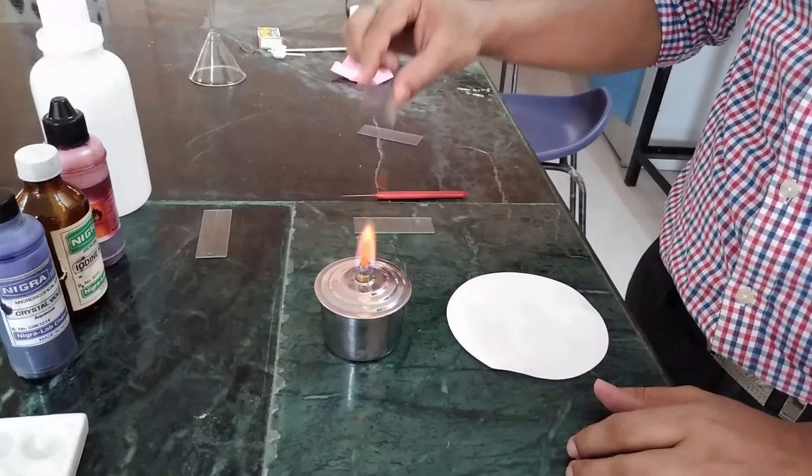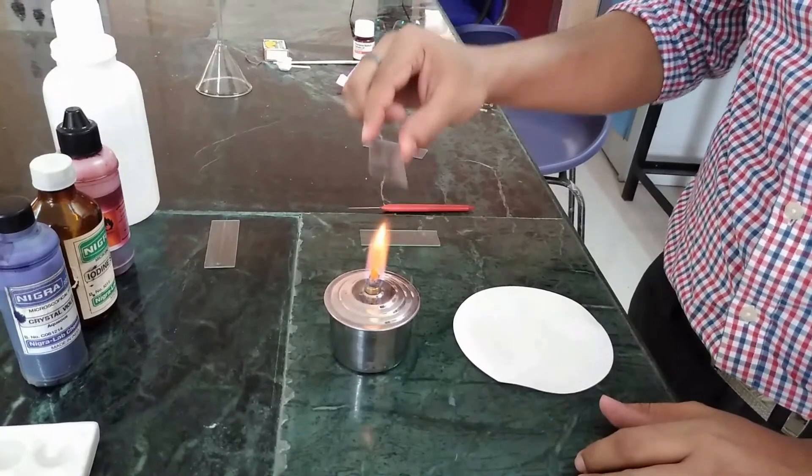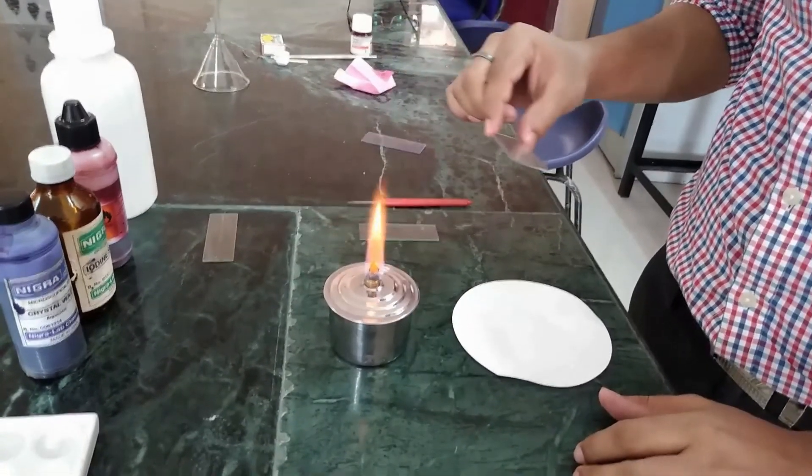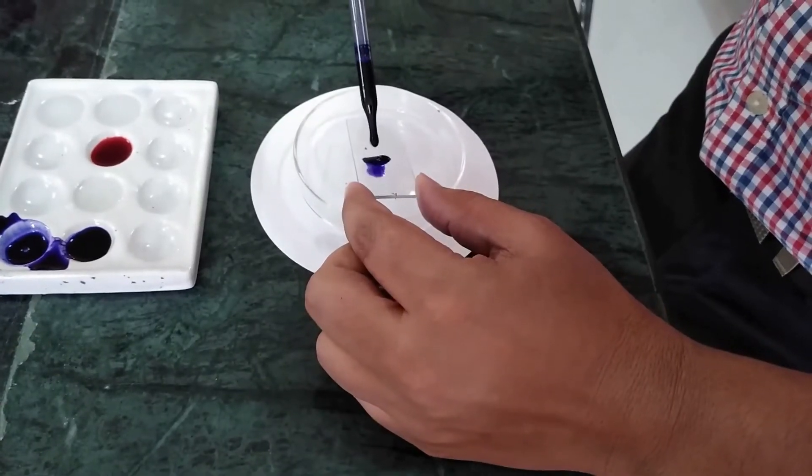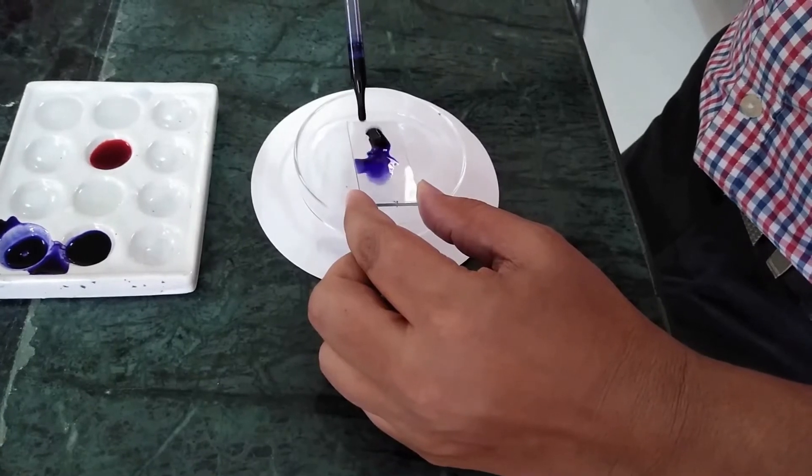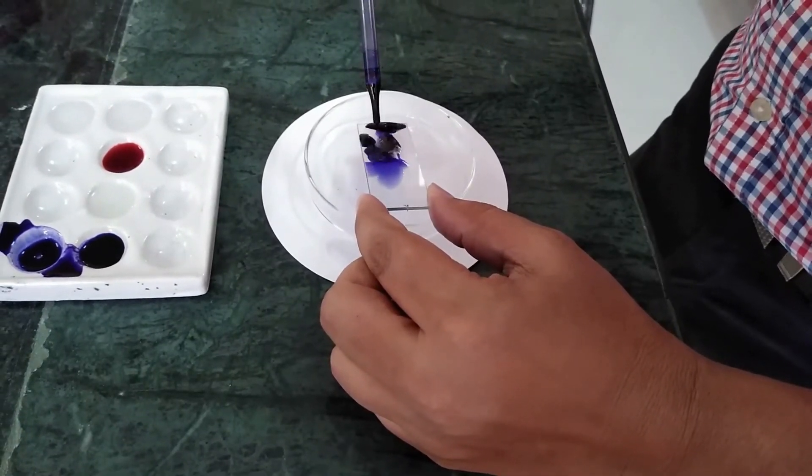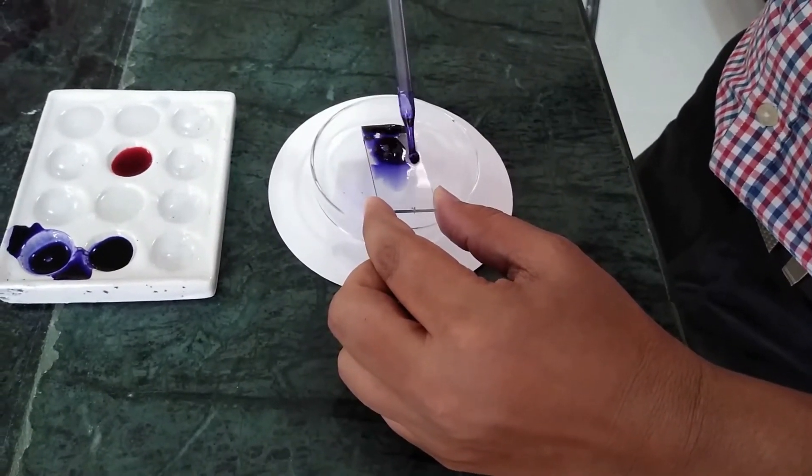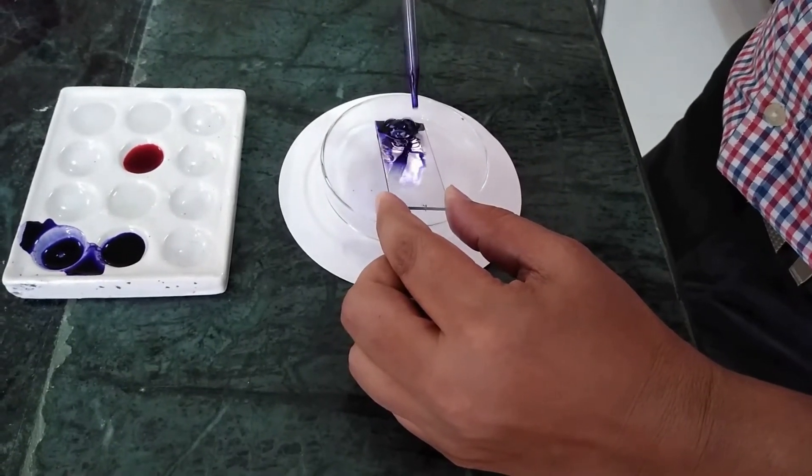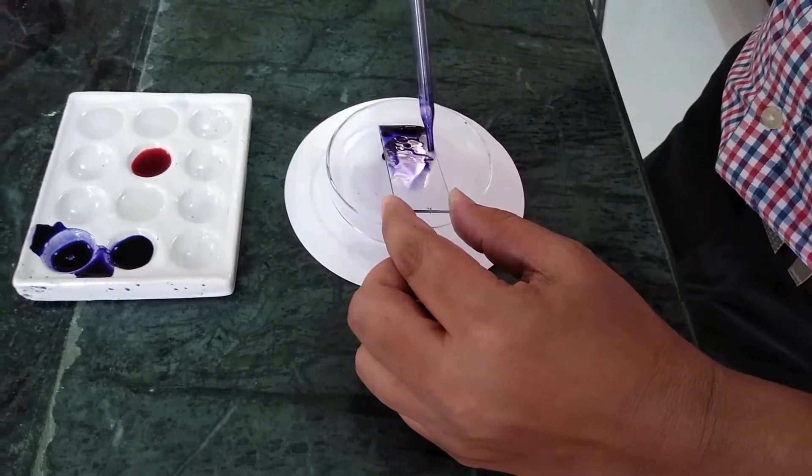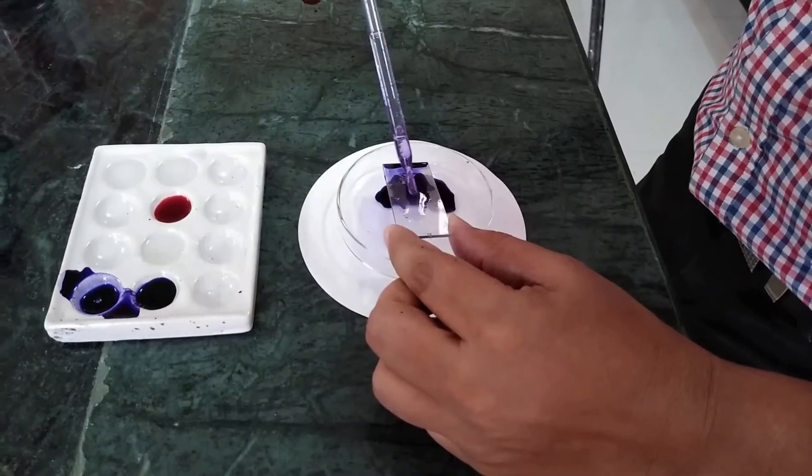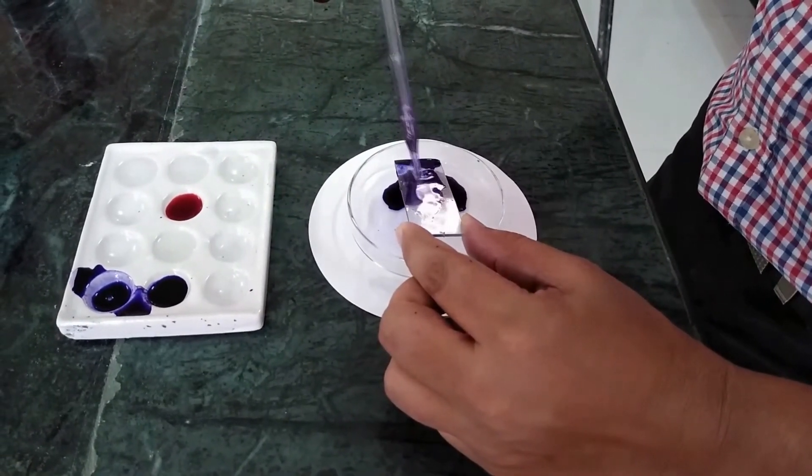Then, heat fixing is done over the flame. After that, the slide is flooded with crystal violet solution. Then, the slide is washed with clean water.